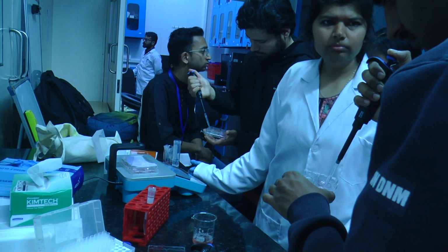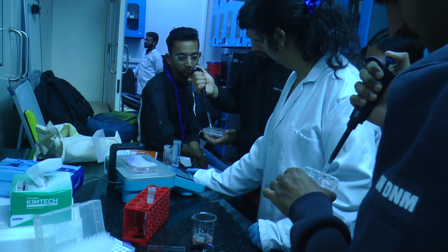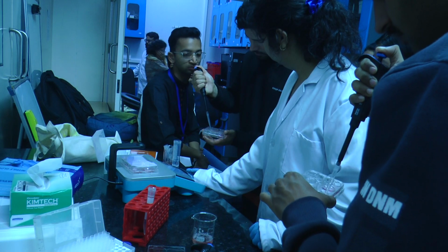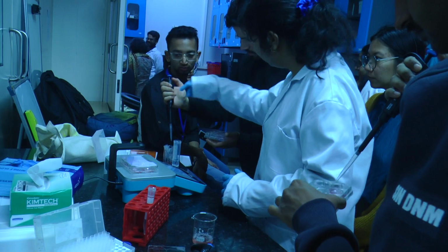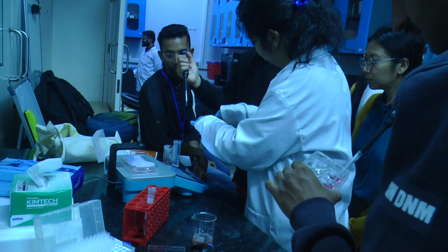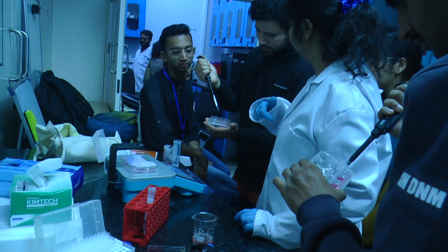There you can see the different shapes we are getting because of osmotic shock. That is not at some specific spot, because the shock is uniform everywhere. So it is just wherever it fits to orient. You just vesiculate out from any part.